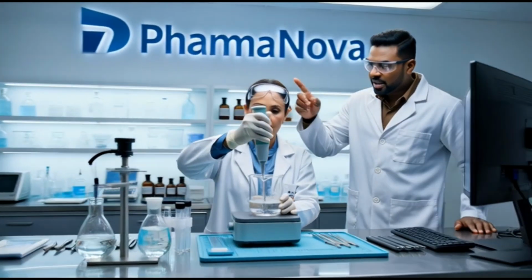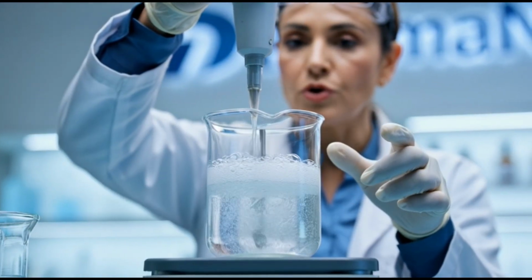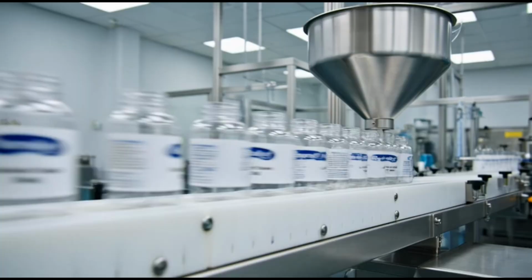The baseline data aligns with our projections. Good. I'll add the stabilizer now. Stirring is active. Monitor for any heat spikes. It's stable. What's the purity reading? 98.7%. Excellent.